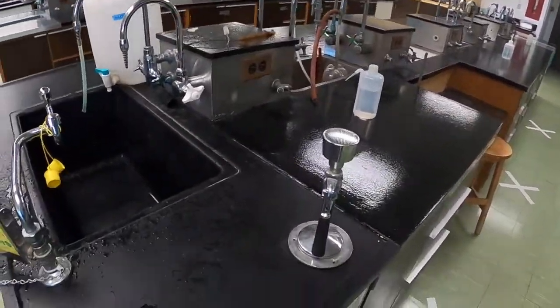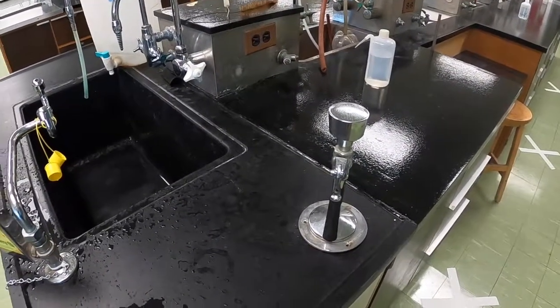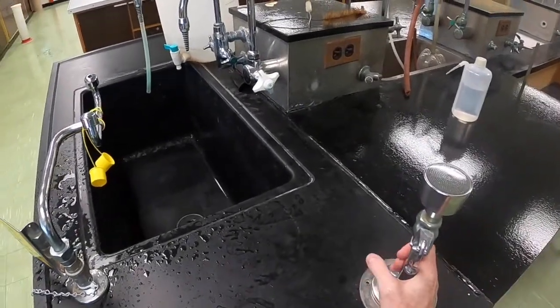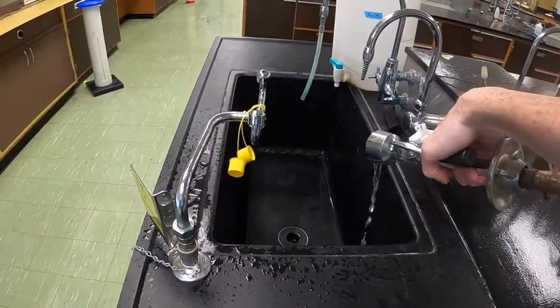In the unlikely event that you manage to spill large quantities of chemicals all over you, we also have emergency showers. This one works just like a movable kitchen sink faucet or a bathtub faucet — you simply pull on it, aim it at the part of the body that you need to spray, and squeeze the handle.